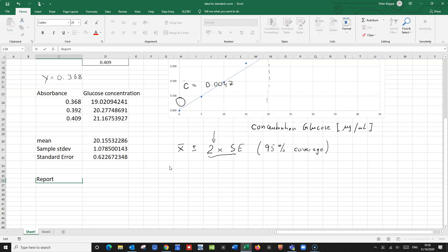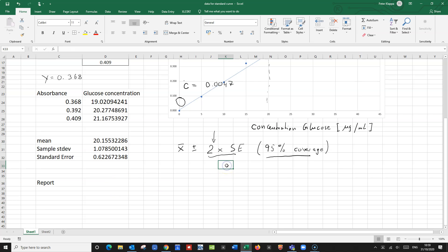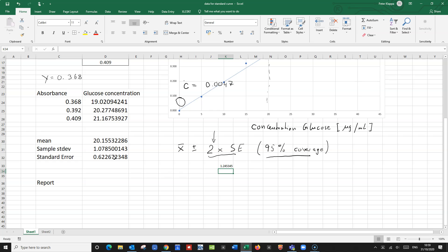We would need to say we have 95% coverage. So we've got the mean — that's 20.155 — and two times the standard error. Let's calculate that: equals two times the standard error. That gives us 1.24.